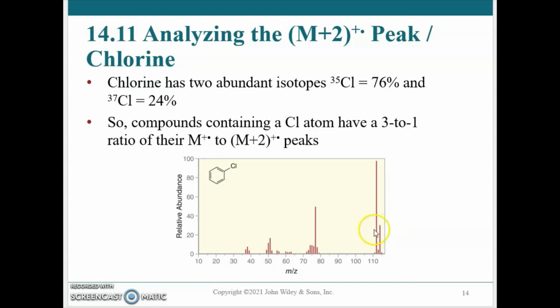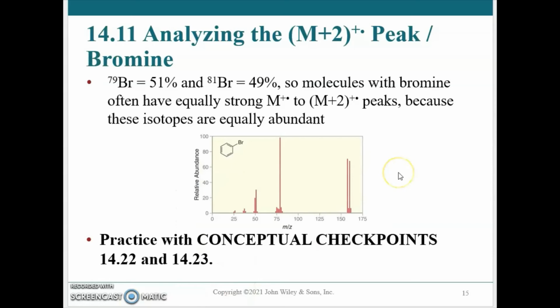When the molecule fragments, the portion of the molecule that does not contain chlorine will no longer show that isotope peak. So that's a second thing to recognize, and it's useful in trying to use the fragments to understand what the parent molecule is. And then I began showing you a spectrum of bromobenzene and the isotopic ratio for bromine.